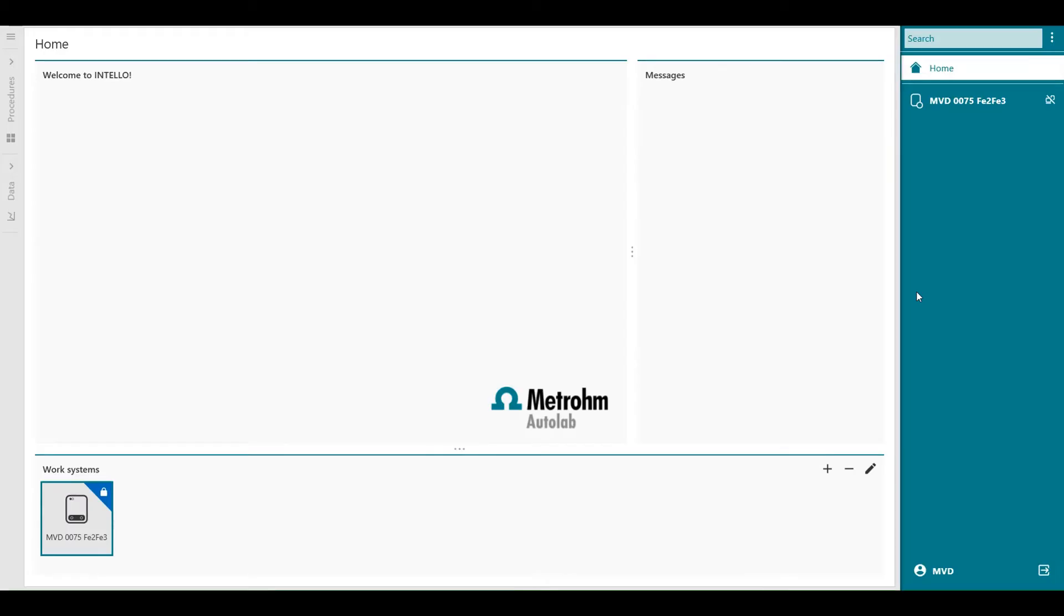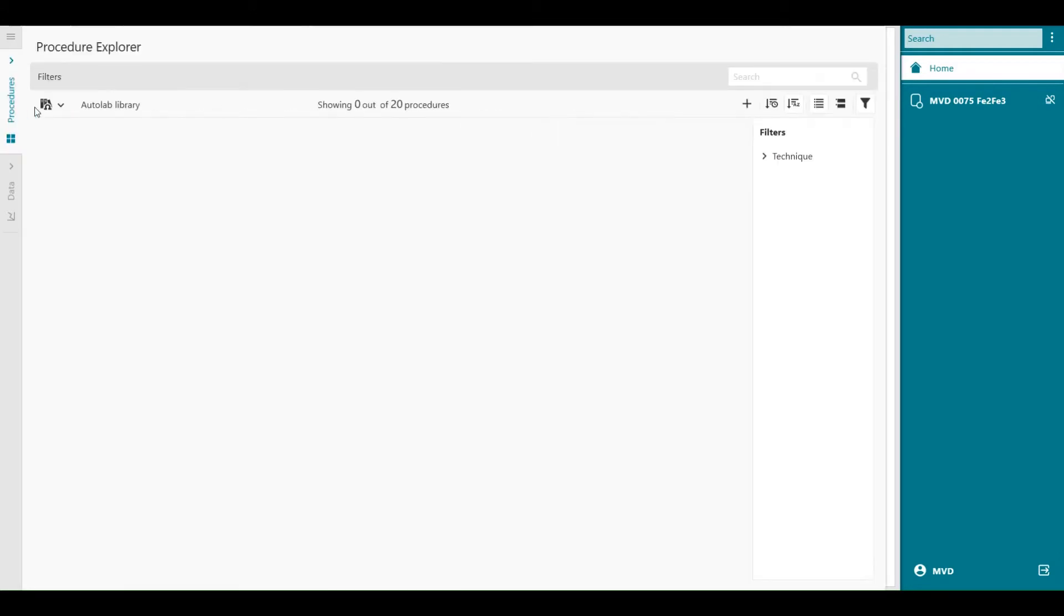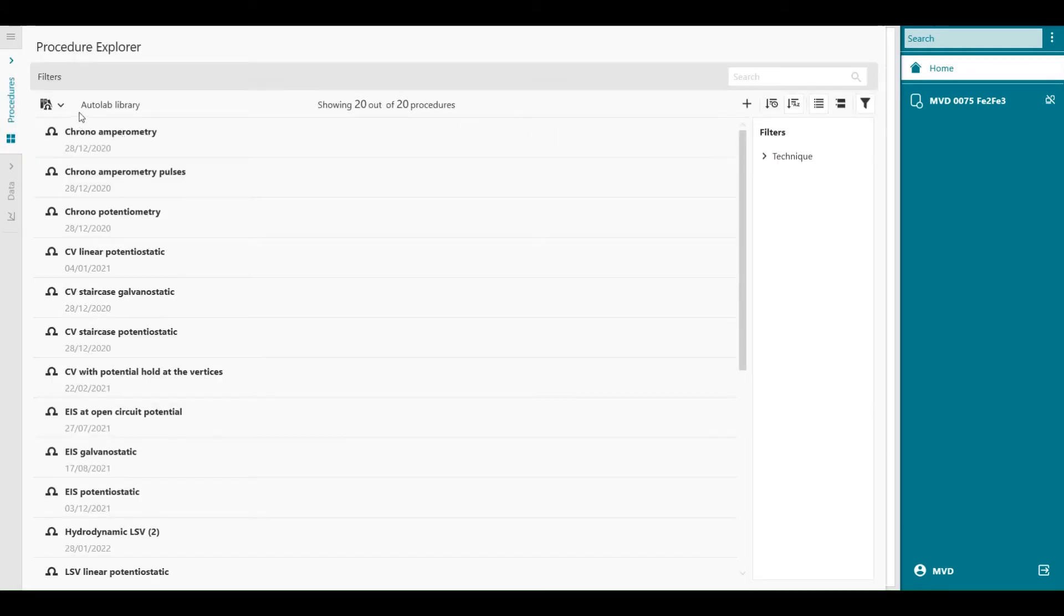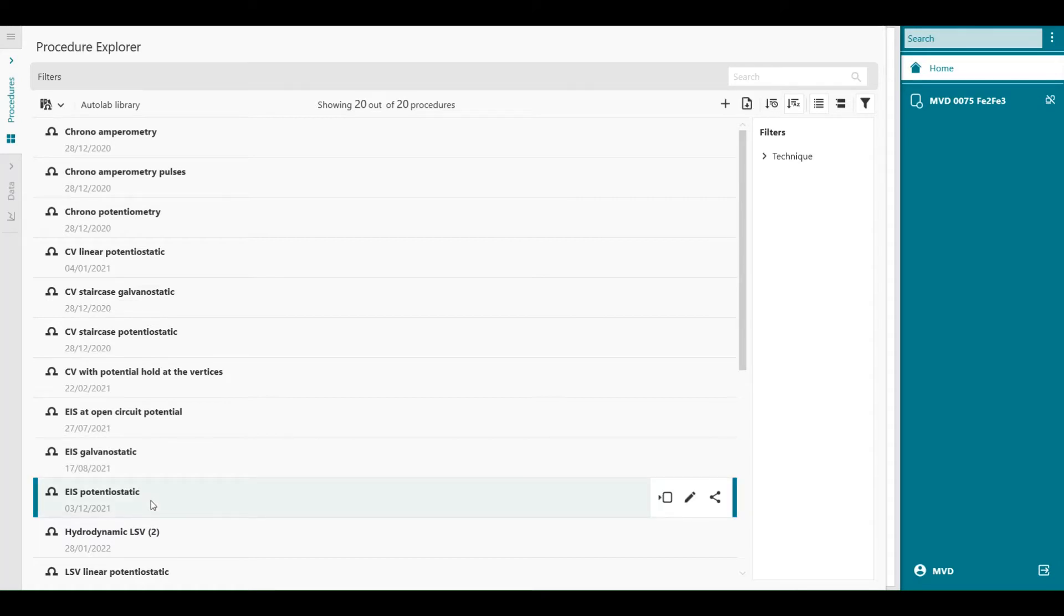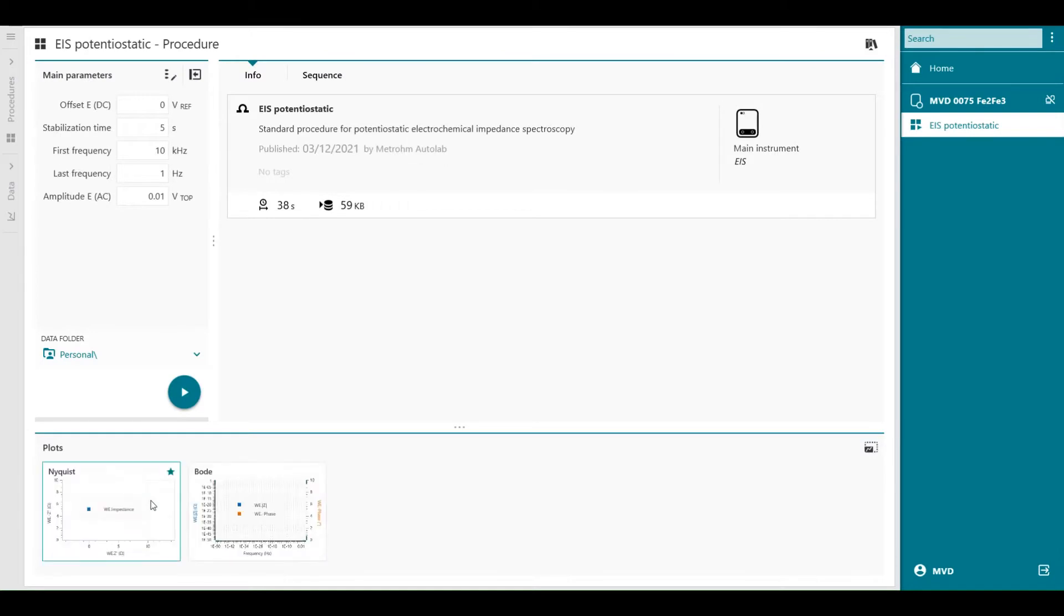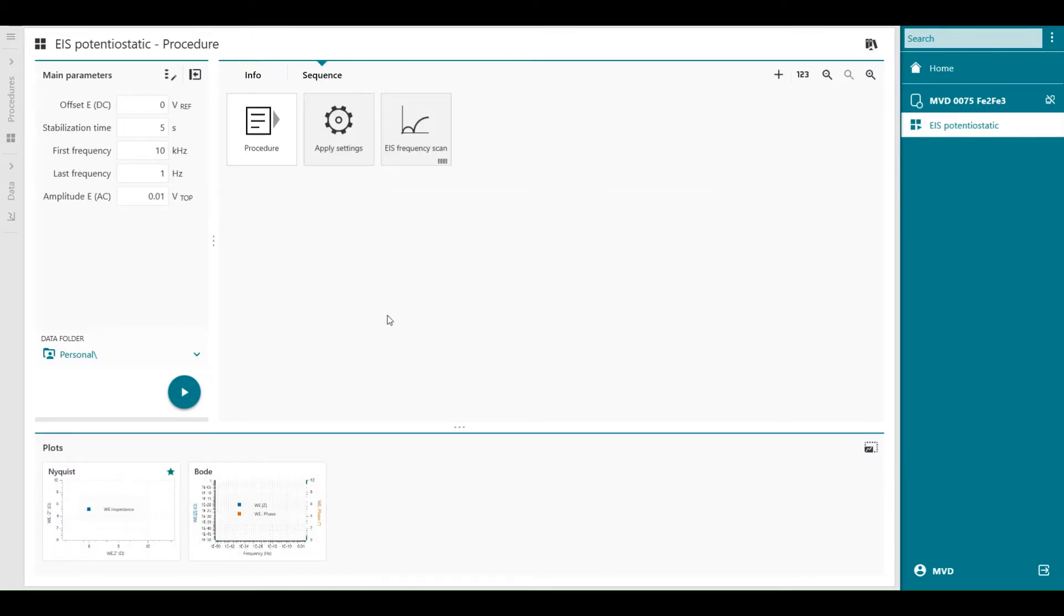Welcome to Intello software. First we're going to load from the Autolab library the impedance potentiostatic procedure, so EIS potentiostatic. Then we're going to look at the sequence of the procedure.